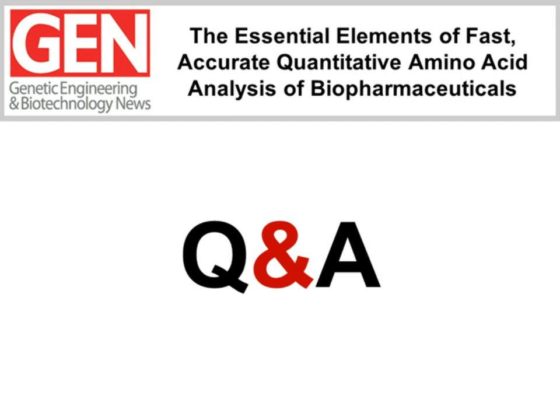If the reaction does not go to completion, the reaction will leave some monoderivatized lysine, which elutes as a separate peak between histidine and serine, and we can monitor the completeness of the derivatization reaction by the amount of the monoderivatized lysine peak. Very straightforward. Hope that helps.